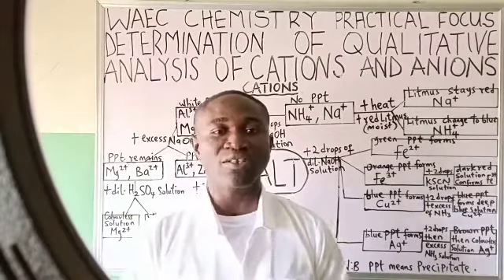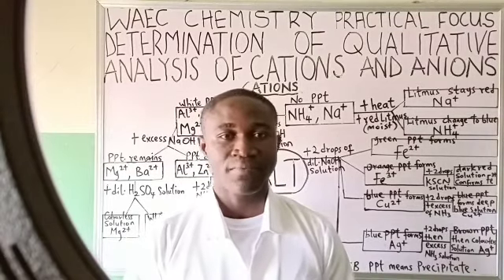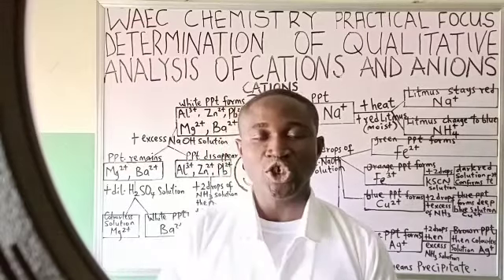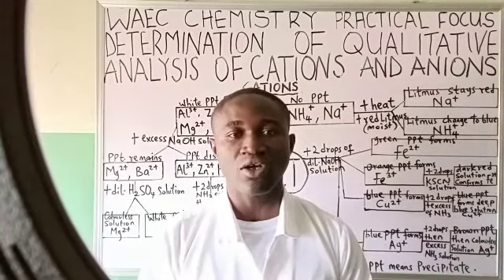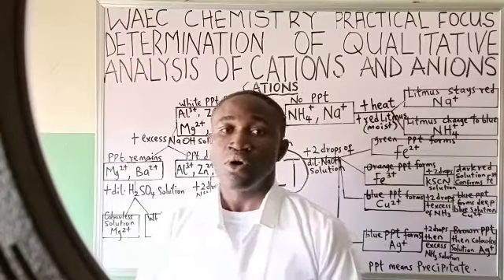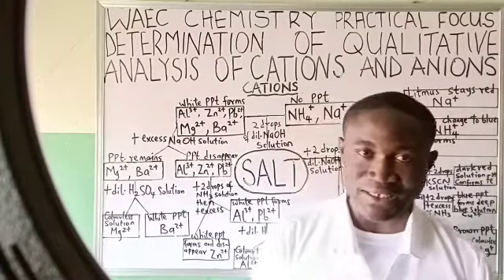Today we'll be discussing chemistry practical, WAEC based, determination of qualitative analysis of cations and anions. We decided to call it determination of qualitative analysis.